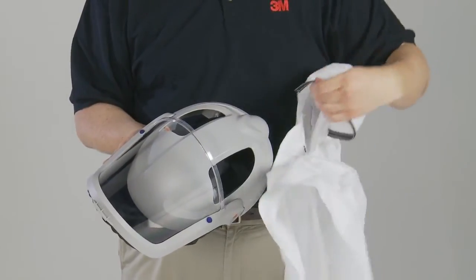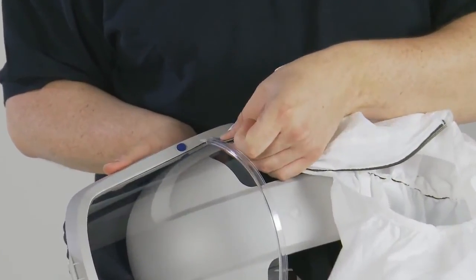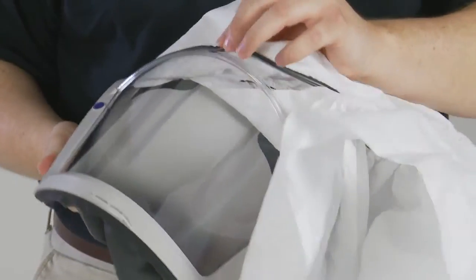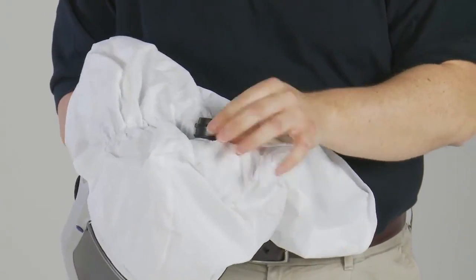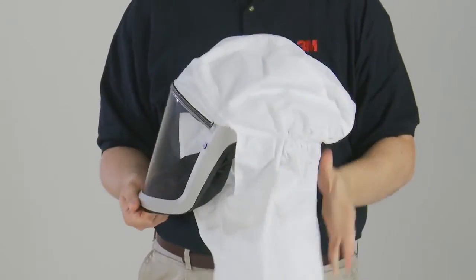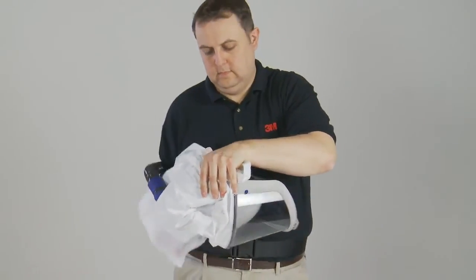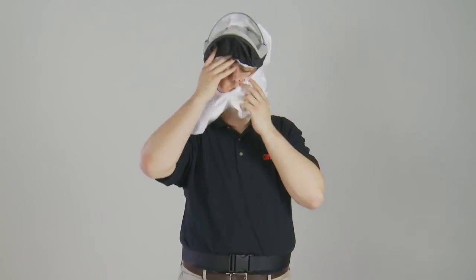The M976 head and shoulder cover can be attached to the M-Series head tops via the groove on the top of the visor. Push the gasket on the front edge of the head cover into the visor groove. Place the breathing tube inlet through the hole provided in the back of the head cover to hold it in place and adjust the edges. The M976 head and shoulder cover can provide protection to the product from contaminants such as paint or dust. To don the head top with the head and shoulder cover fitted, gather up the cover and place on your head. Pull down and adjust the cover around the face, then lower the visor and adjust the face seal as necessary.